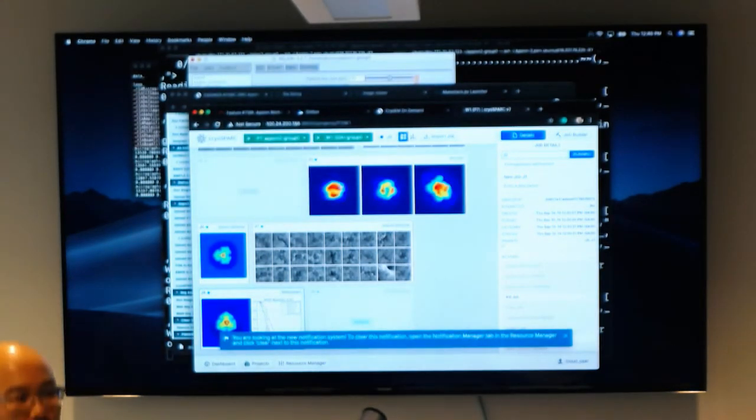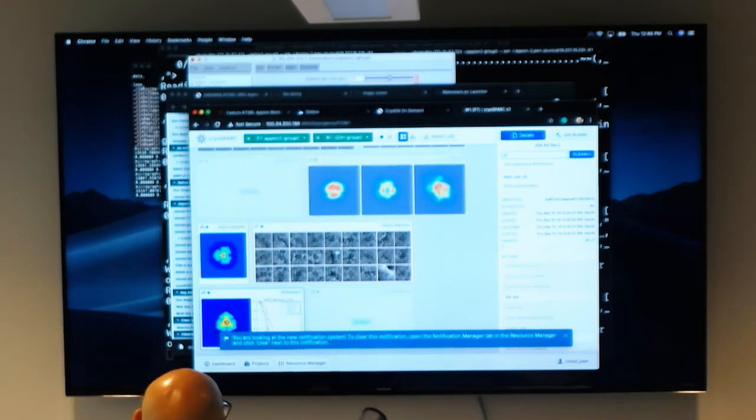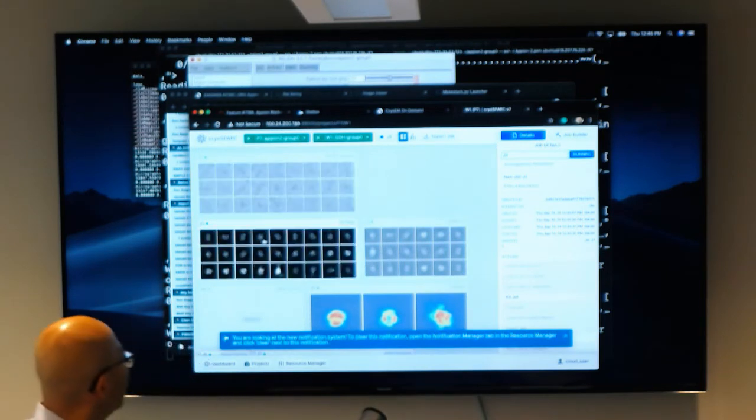To make sure that you have the right box size, what do you look for? In this case, we already assumed that you extracted the particles with the right box size in Relion. If not, you would see that the box doesn't contain your full particles, so you might decide you want a larger box size.